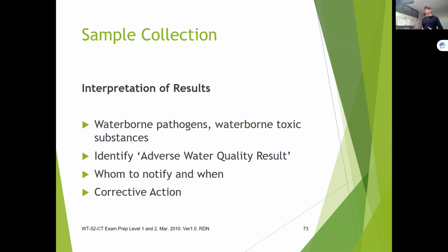Unfortunately, things happen. Sometimes you get results back that are not what you really want. Make sure you have a protocol to follow. If you have a bad chlorine residual, what are you going to do? I always like retesting first. That's always going to be your first thing.